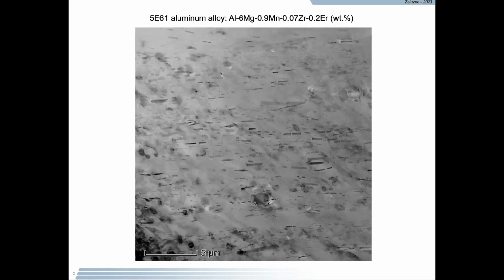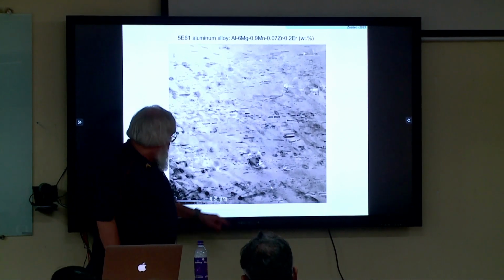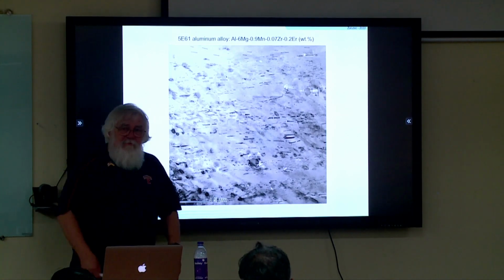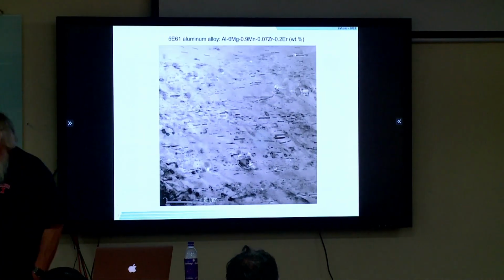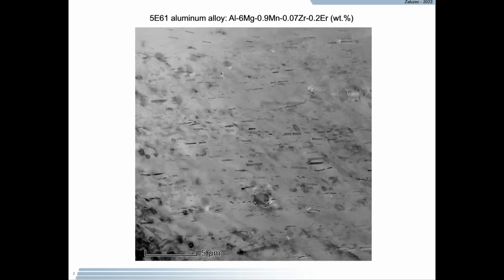Now, can we do diffraction contrasts on these and analyze what's going on? Yes. Can we do morphological studies on this and say, well, what do I have? I've got rectangular things, round things, square things, all kinds of stuff. We can spend a lot of time doing the defect analysis, and that'll be valuable information. But is there another way that we can get information?